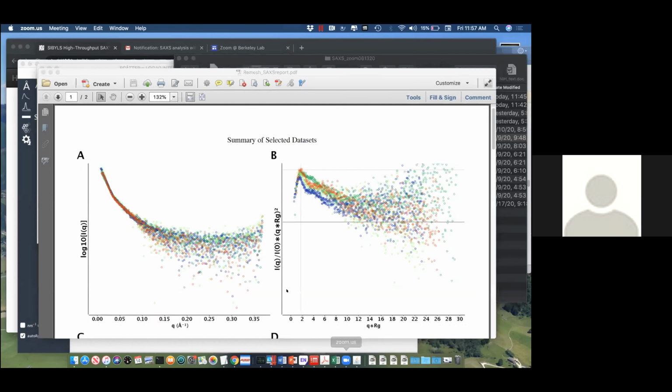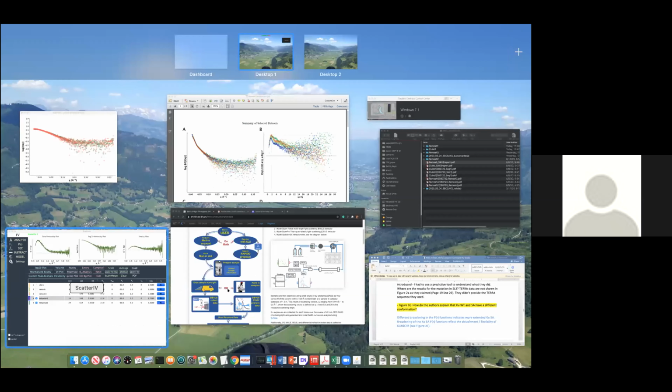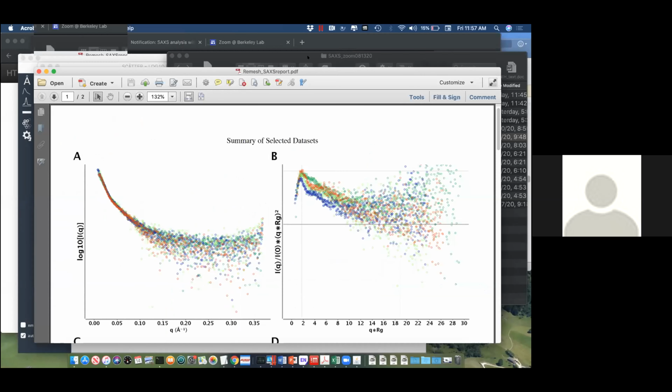All right. With that, maybe, I don't know, Mikhail, you've got a couple more minutes. Maybe we take 3 user cases, max, spend 10 minutes. For those of you who don't have a specific question, feel free to split. But if there are some user cases out there, maybe 3, whoever hits it first, you can say, I want to see my data analyzed real quick. This folder, this file. Top 3 takers.